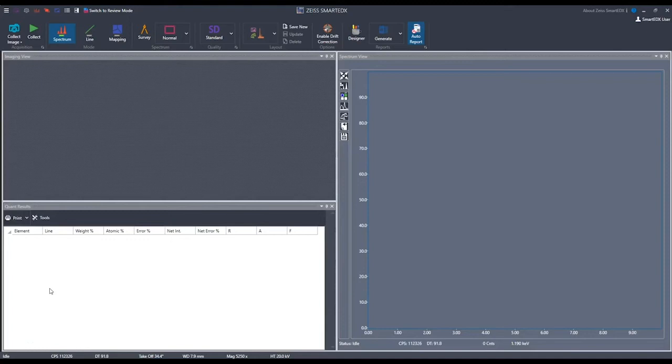Hello everyone, my name is Maddie Sawinski and I am a sophomore applied physics major. And I'm going to be showing you another feature of the SEM, which is elemental composition analysis using X-ray energy dispersive spectroscopy. And this is a really long name, so we just refer to this as EDS. And to do this, we're going to start by first capturing an image of our sample.